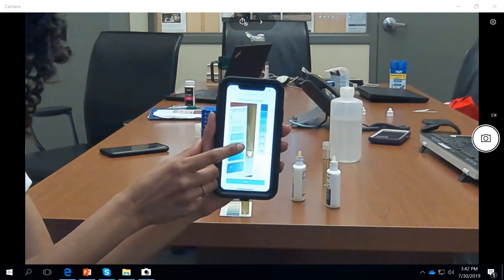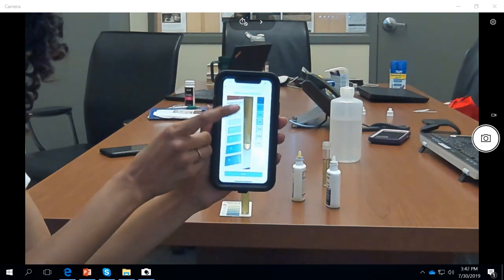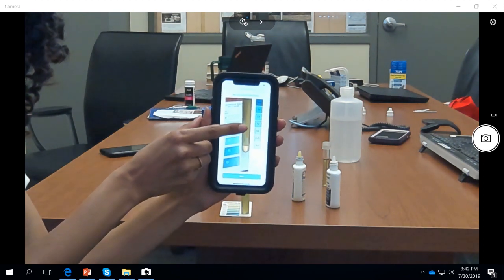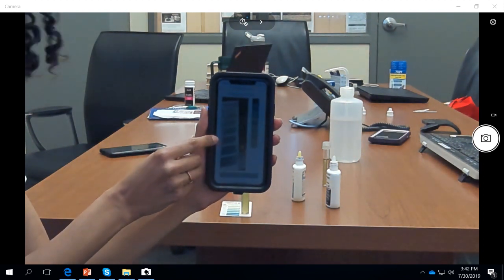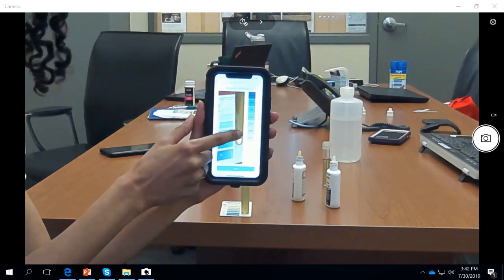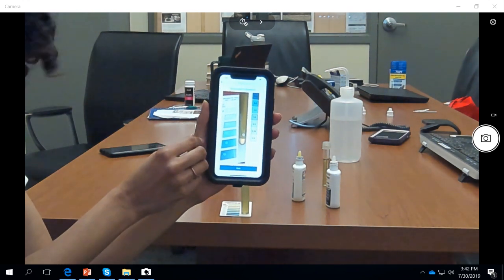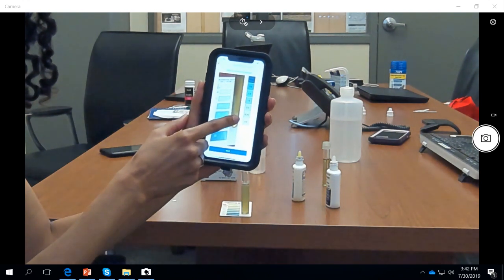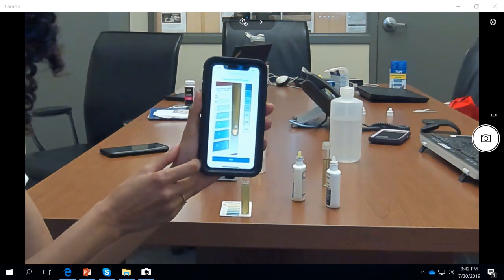Then you can select the test pixel on the vial. Again, make sure that the test pixel is found within the inner cone on the bottom portion of the vial. Above should be a darker color and then darker again, but the lightest color you'll find is at the bottom, where you'll see a cone shape. And right in the center of that lighter cone, you should click for the test pixel. Once you are happy with your pixel selection, you can click Next.